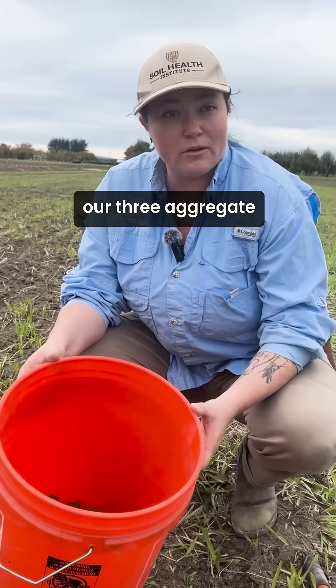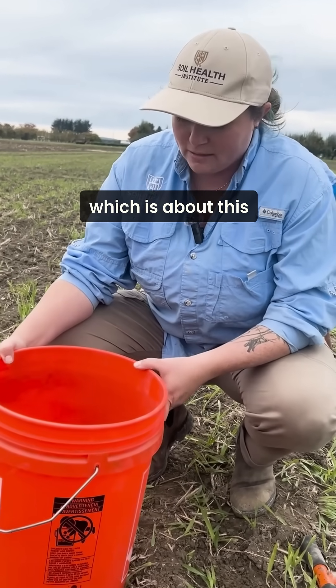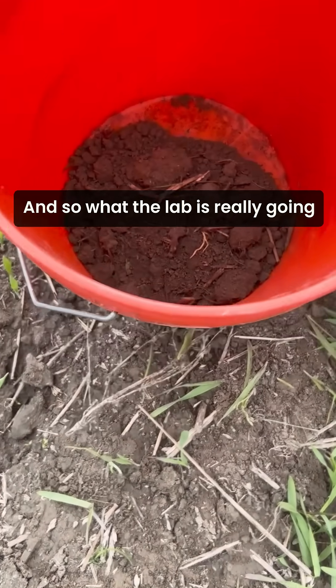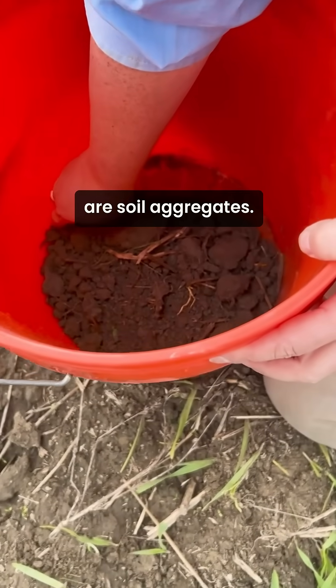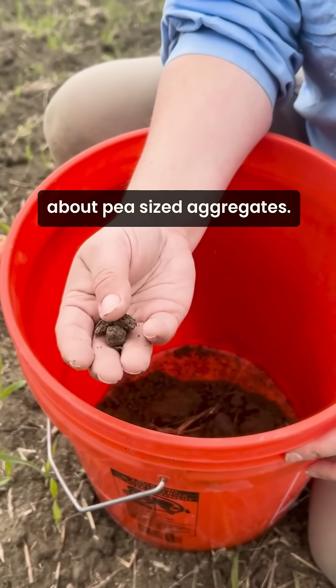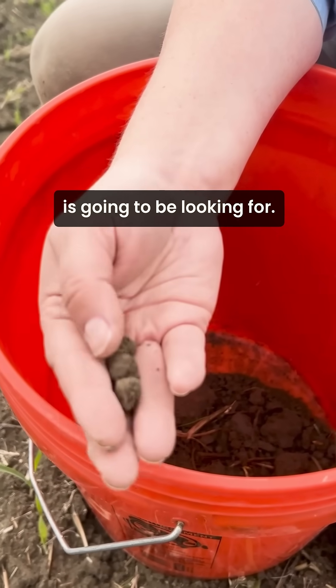Now we've got our three aggregate stability plugs — about this much soil in the bucket. What the lab is really going to be looking for are soil aggregates — about pea-sized aggregates, that's what the lab is looking for.